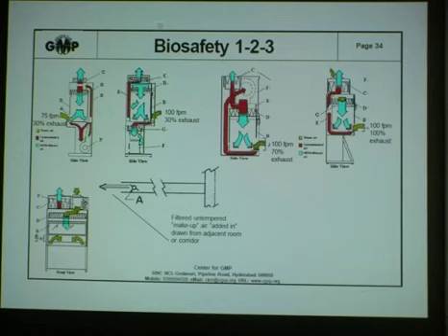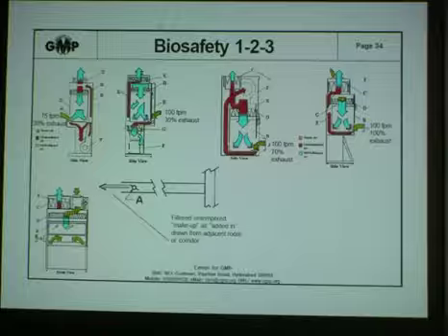So for that, you have something called an add air system. You take air from some nearby corridor; it need not be tempered or controlled environment. You take the air and filter it, or at least pre-filter it, and bring it into the plenum. And then you exhaust it.